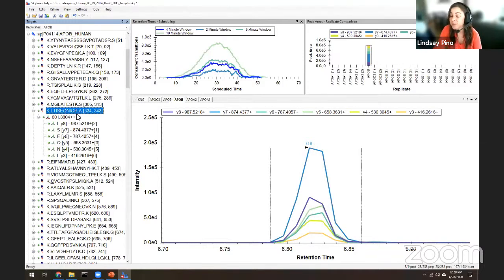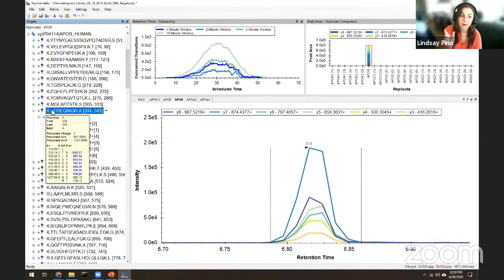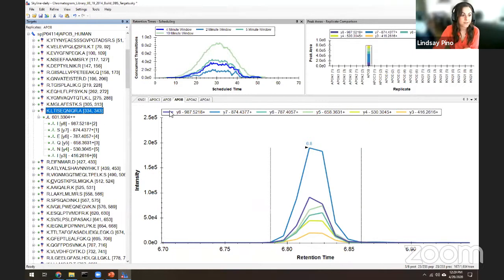That would probably change the precursor mass to charge, unless it was another phosphorylation on the threonine. So if it's an isoform, then the precursor mass to charge that you program into the mass spectrometer will be the same. And you need those site localizing fragments to determine where the modification is. However, if you're looking at, say, a histone tail, where you can have an acetylation or a phosphorylation, that'll be a different mass shift. Even if it's the same unmodified peptide sequence, it would be a different mass shift. So you would look for different precursor mass to charge, not different charge states of the same mass, if that makes sense. I think I've got just one more minute left.